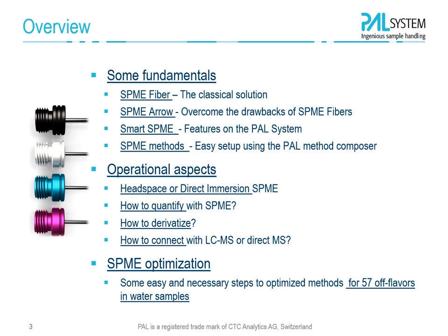We then will dive a bit deeper into the optimization of SPME analysis with a typical application. It is about flavors, but in this case about the nasty flavors from water. We will see a few easy but necessary steps to establish an optimized SPME method.